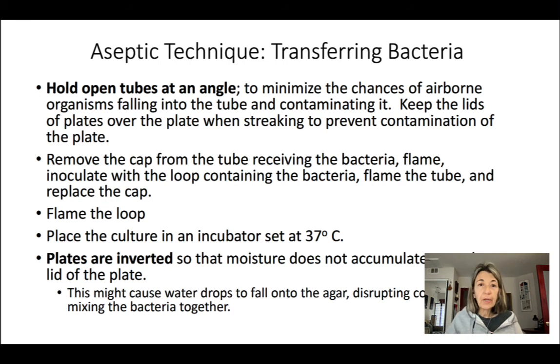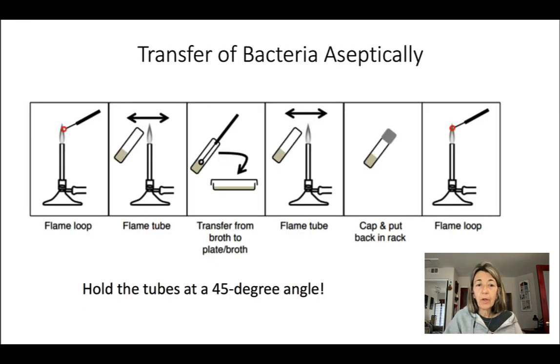So that was the summary of the aseptic technique. Watch the videos, do the simulation. It's going to make much more sense, and be sure that you are clear with the BSL levels and what kind of microbes used for which, and also all these steps in doing the aseptic technique.